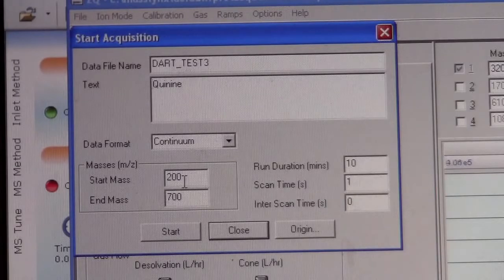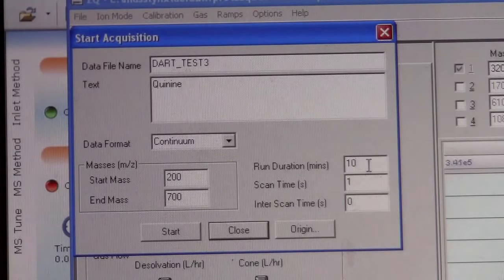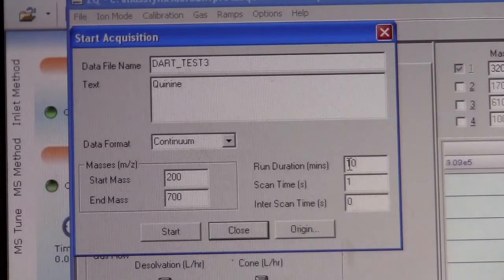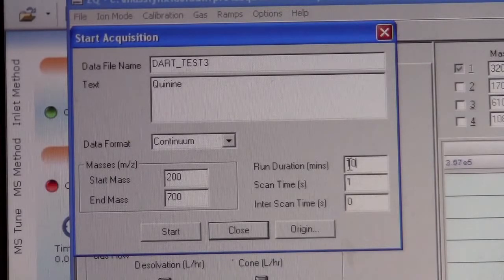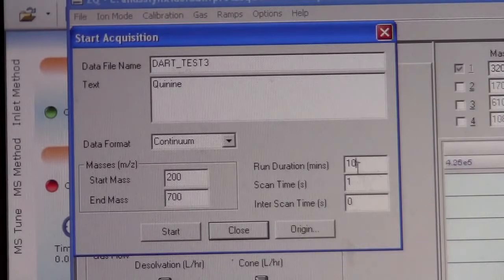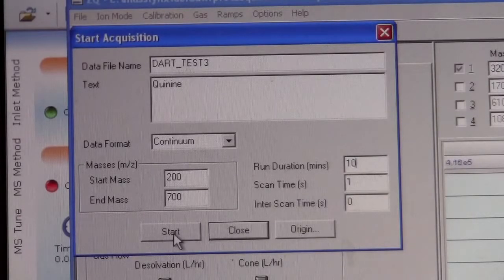We can set the mass range. And then the run duration. This run is how long you want to have it run while you put the sample into the instrument. This is all set reasonably. We can click start.